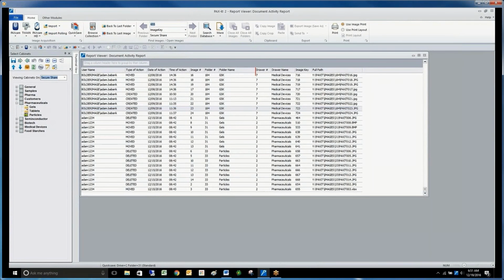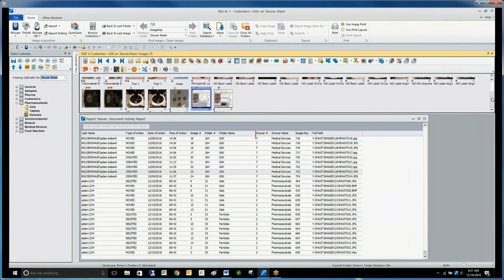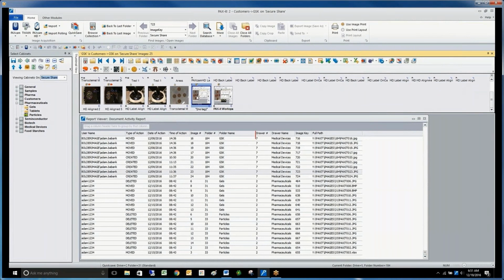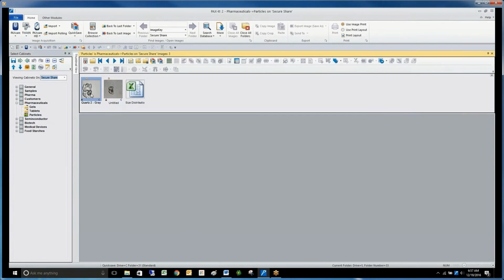To help users better identify a specific file, a unique image key is given and can be easily searched by entering it into a simple navigation bar on the PAXit Home tab. This enables users to get directly to the file in question for easier identification and correlation. All PAXit audit trails perform in the same fashion, and from these records, a user is able to prove accountability to anyone inquiring along the lines of 21 CFR Part 11.